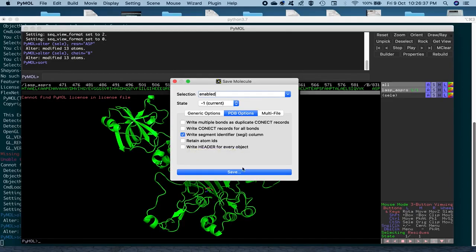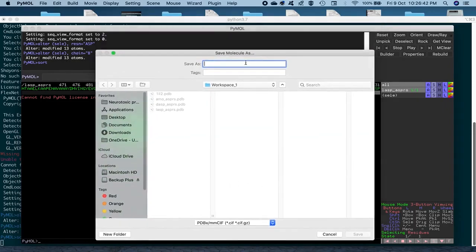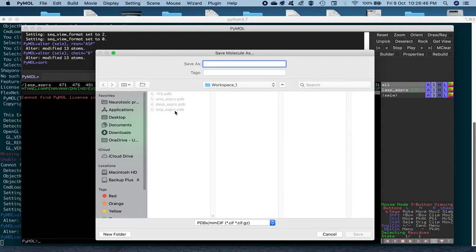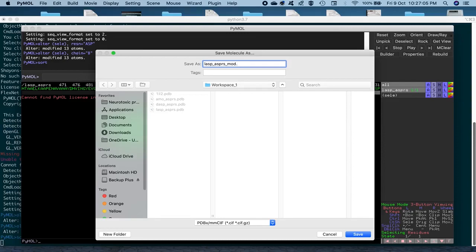So, we'll go ahead and save it in the same directory, the workspace one. And we give it a different name, because we don't want to overwrite this LASP ASPRS that's already written previously. So, we give it a name, let's say LASP again, and then ASPRS, and then MOD. So, underscore MOD will identify it as a modified PDB file.